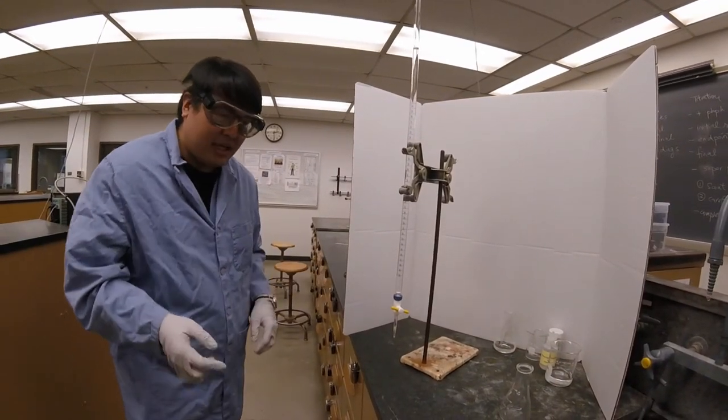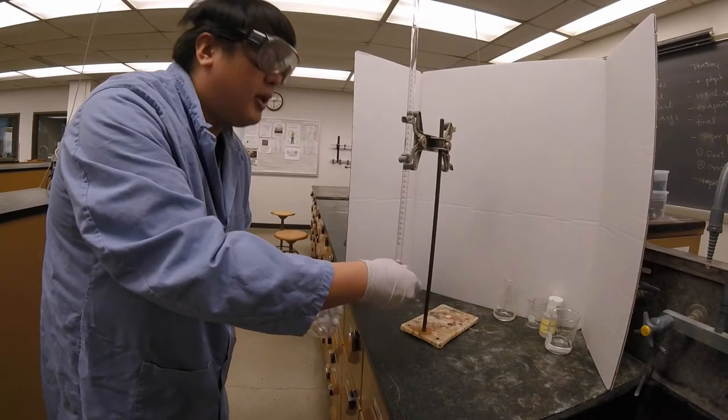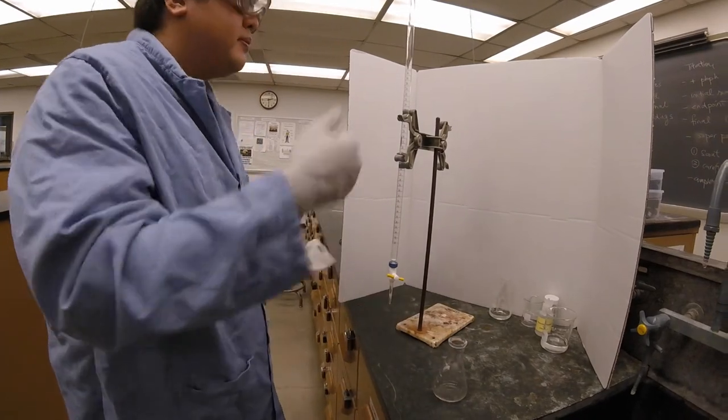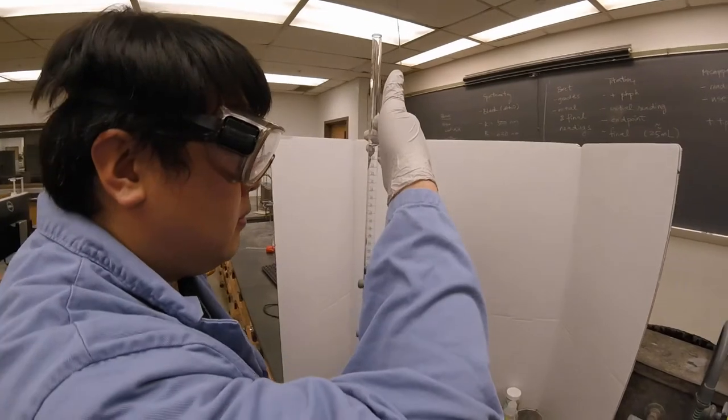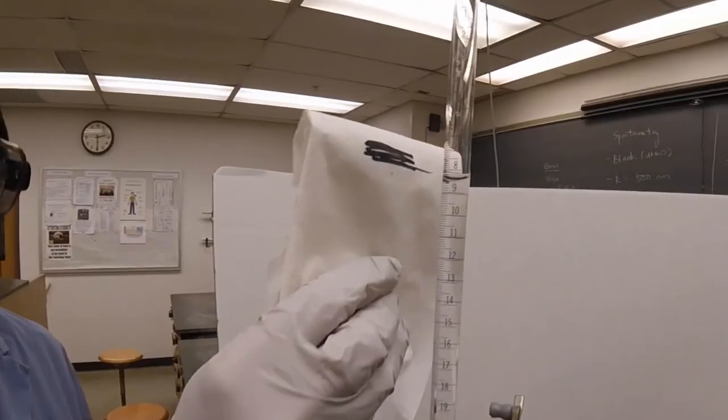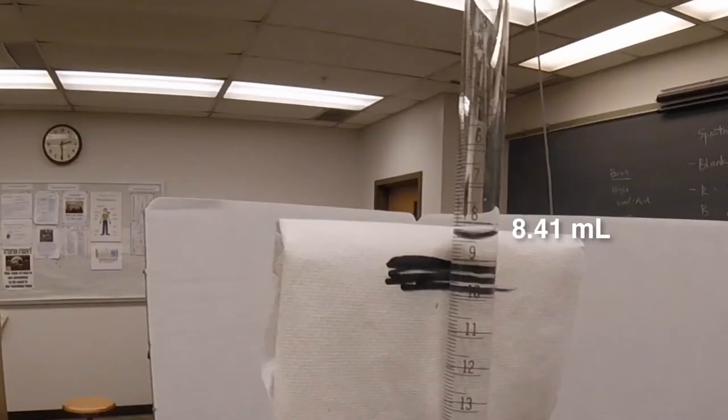And then now, if we let some out and I were to take another reading, this reading would be around 8.41. So that's around 8.41 milliliters.